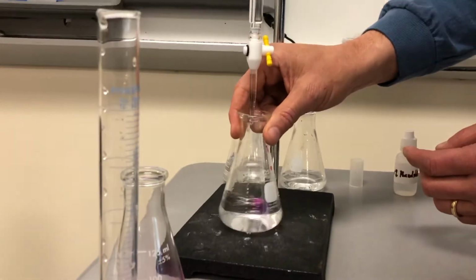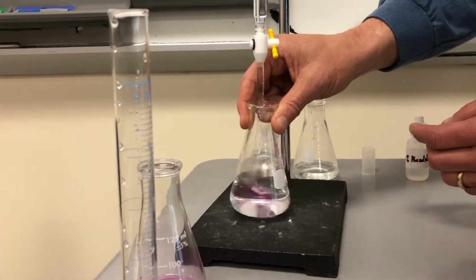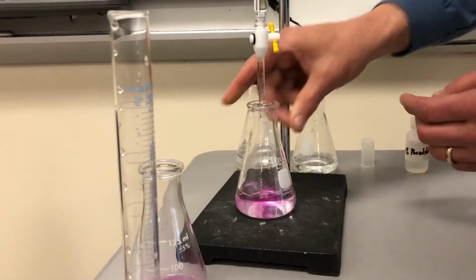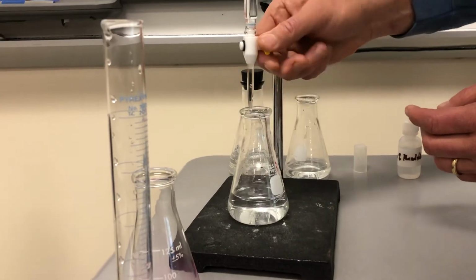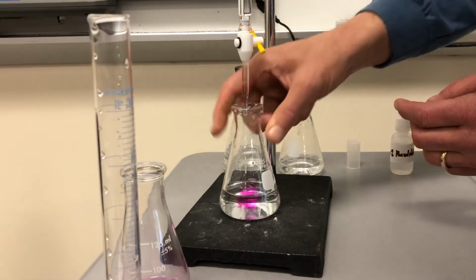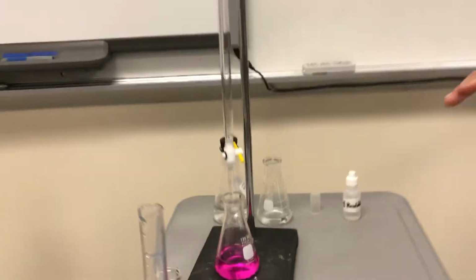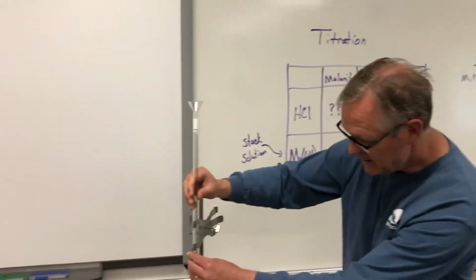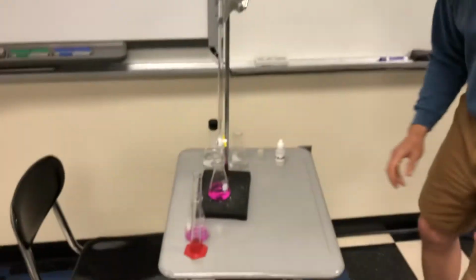Very tedious work, because it starts off and then it starts slowing down, and then you never know exactly. Right there. Nope, not quite. And there we go. So we got a color change. It's a little bit deeper than I'd originally liked, but it now is completed. So when its color changes and holds, you're through.